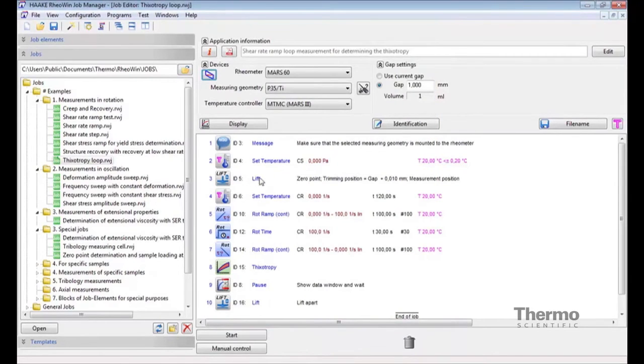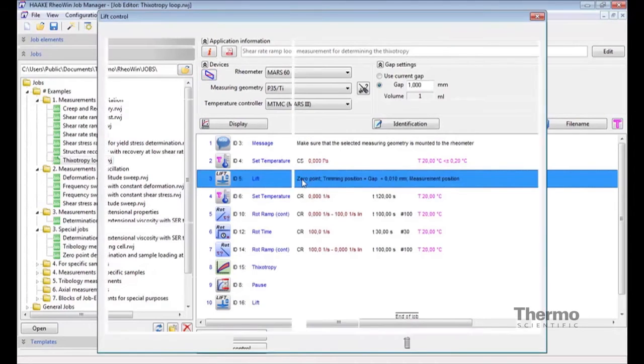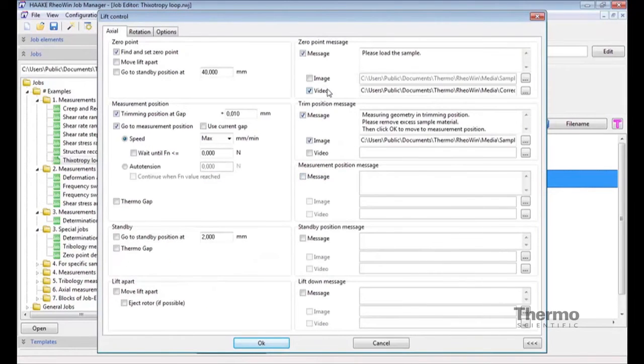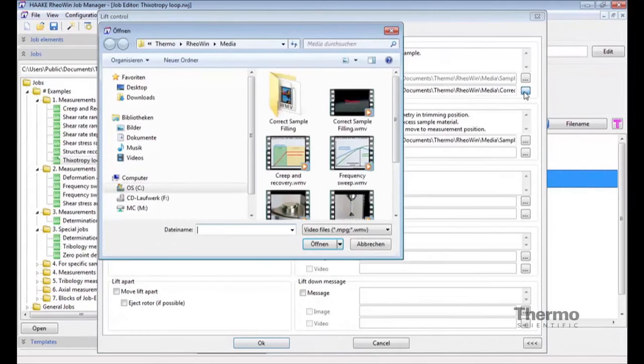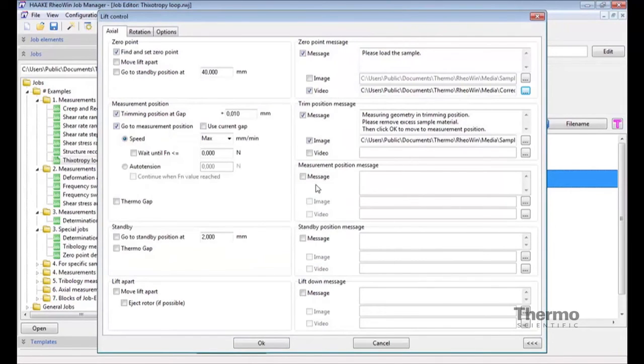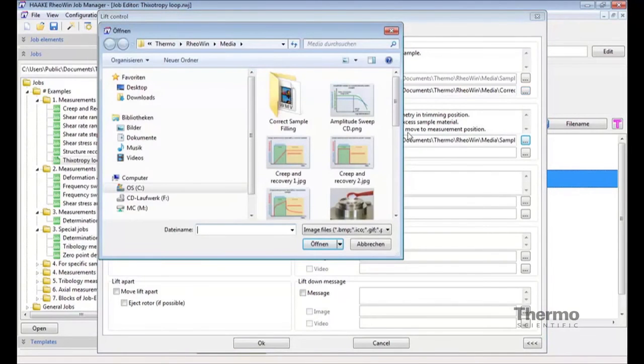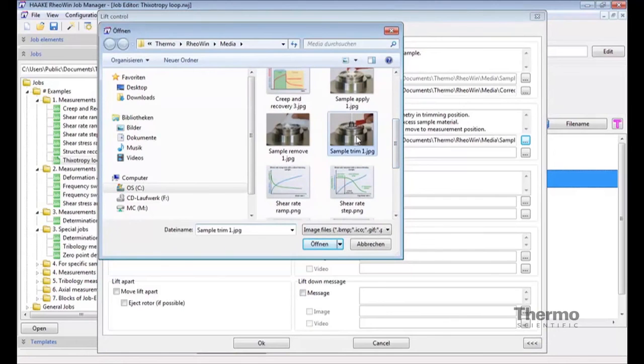Many elements such as the lift element have been updated to incorporate additional guidance via images or video files, for example, on how to correctly fill or trim a sample. These images and videos can be either chosen from a range of included examples or they can be added later by yourself.